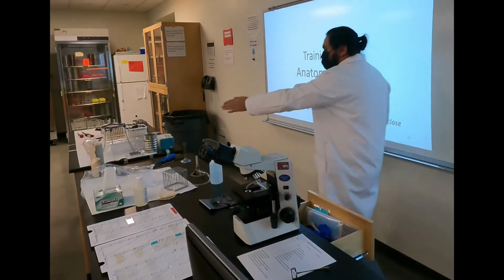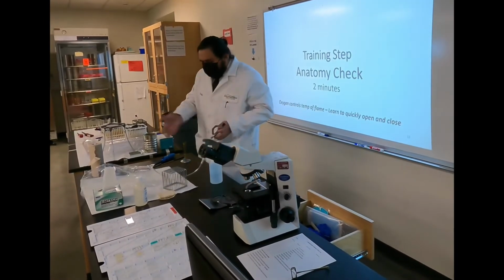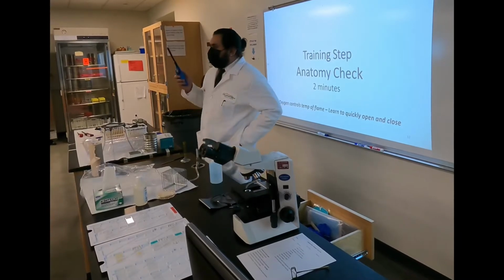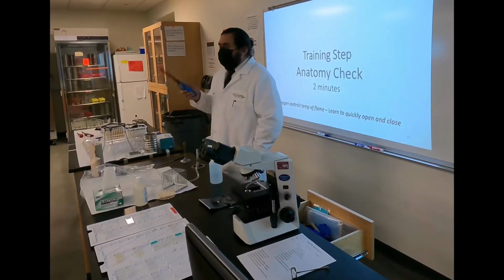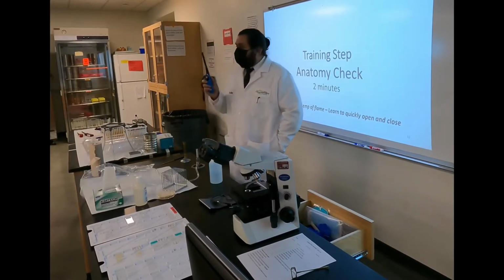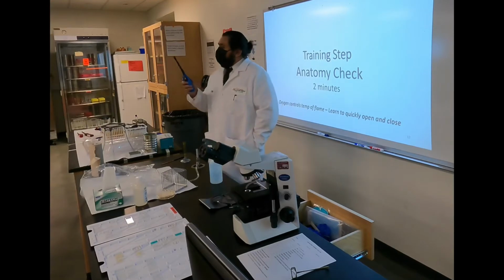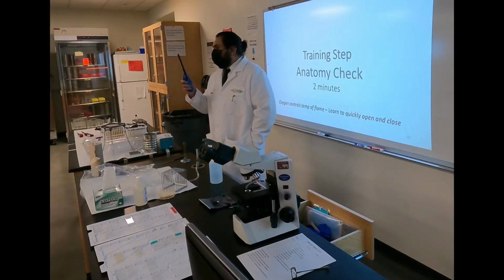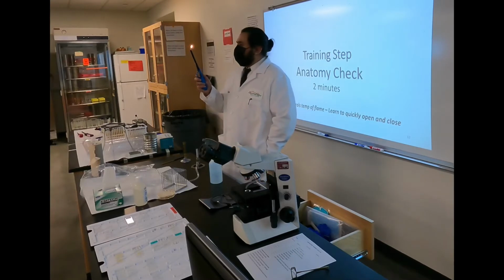So check the valve, check the tube, and then the next thing is check your awesome ability to turn this on without failing. Why do I say this? Because every semester everybody thinks that they're an adult until they realize they don't know how to use a lighter. They go on, and it doesn't come on, and they're like, yeah, you suck at this. So make sure you can get it on in the first shot.